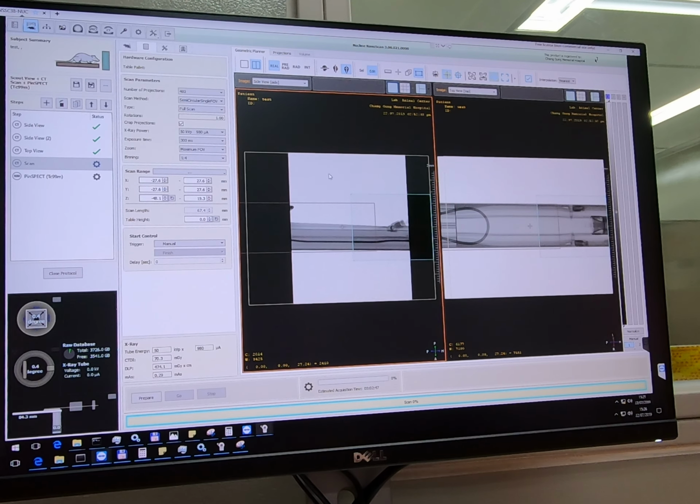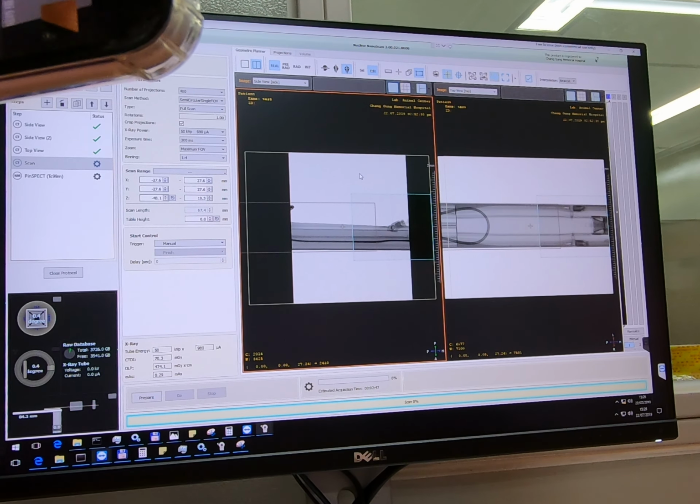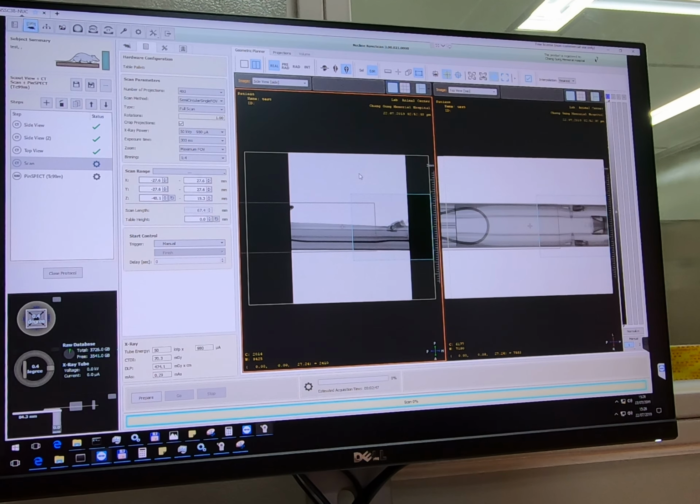So we can throw away. 一般他会建议我们怎么用那个 protocol？一般他会建议我们用哪个 protocol？一般就扫一般，就 default 的啊。就你之前在扫那个，就是最低的那个，比如说 kVp 最低，然后 projection 最低什么之类的。大小鼠会有差吗？What is the default protocol you recommend for us for the mouse scan or rat scan? Are there any parameters you are recommending?